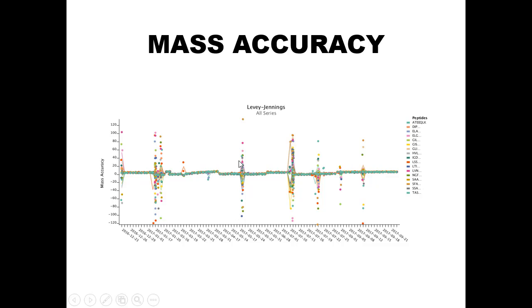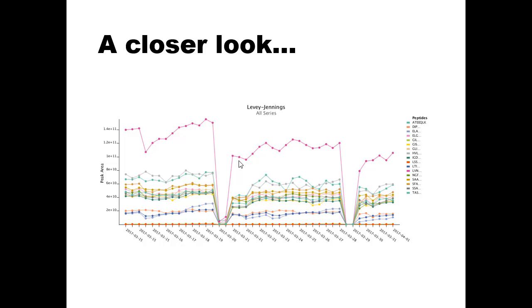So this is sometimes a good metric to see how well different users are taking care of a mass spectrometer, because if users are always leaving the instrument uncalibrated, you can kind of call them out on it. So I'm zooming in here. I changed the date range in Panorama Web and zoomed in on a period from mid-March to the beginning of April. So this is just showing 2 weeks. One solid chunk of data collection where I was on the instrument nonstop.